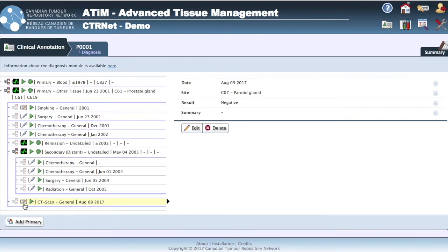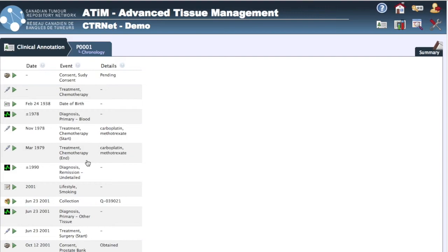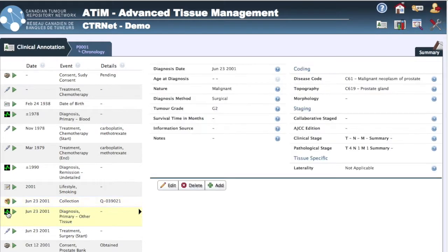Although the design of this bank was initially created for tumor biobanking, the diagnostic fields can be changed to reflect other bank needs, such as childhood illness biobanking. A participant's clinical history can be accessed and viewed on one page, allowing for a chronological and comprehensive quick view.